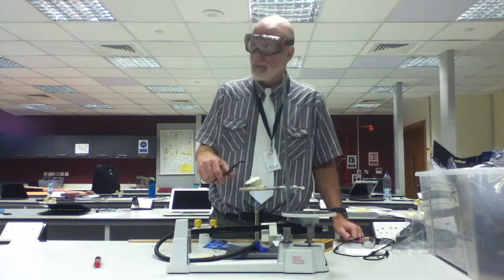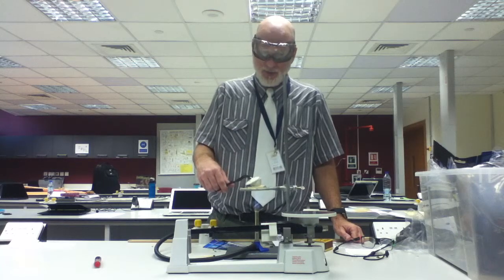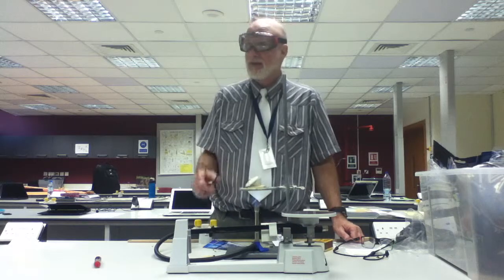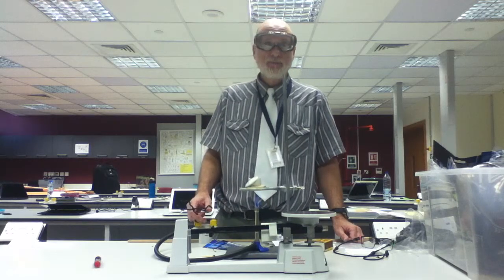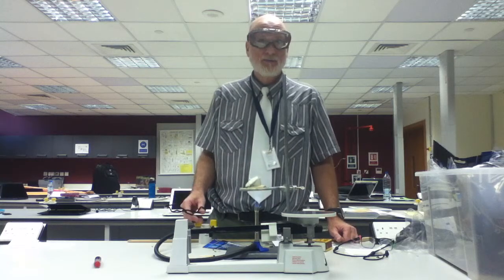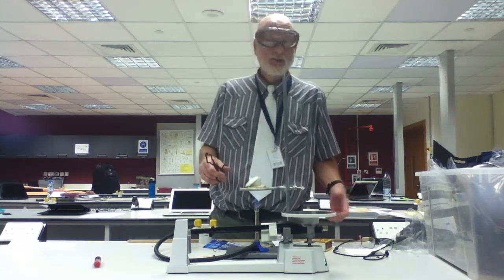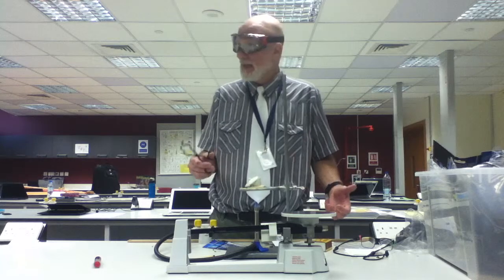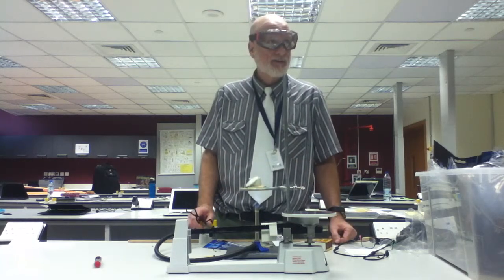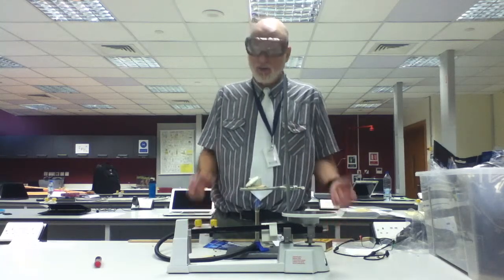I've opened up the crucible, closed the crucible. You want to make sure everything is reacting. Nothing has reacted yet, so it's going to take time to react. Okay? Yes? You want to take notes and observations, etc. You're going to see smoke come out. You're going to see the reaction will take place, but it takes some time. It's got to get really hot, very hot. Clear? That's the lab.